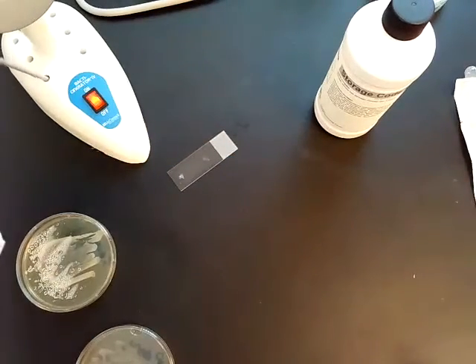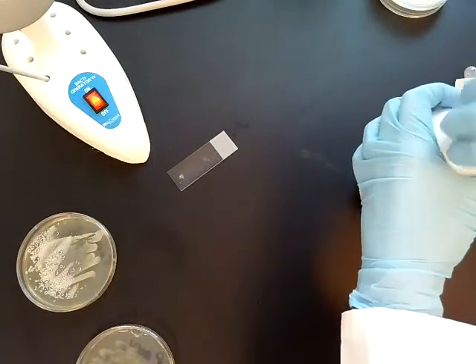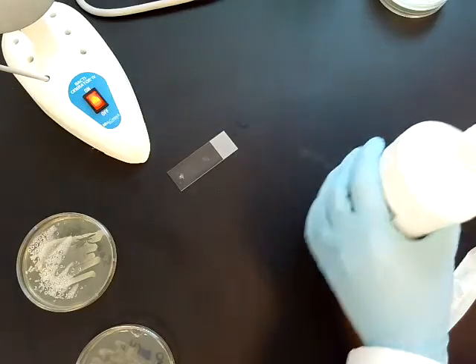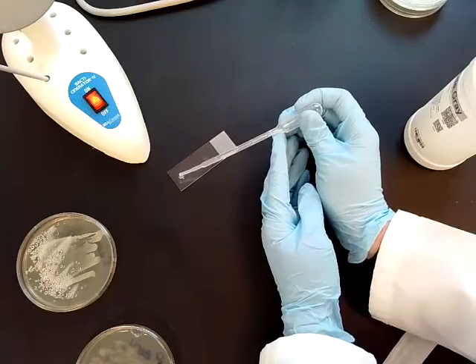So now I'm going to add hydrogen peroxide. Hydrogen peroxide, it's just 3% hydrogen peroxide. This is the same grade that you can buy over the counter at any store. And I'm going to add a drop to the bacteria directly.